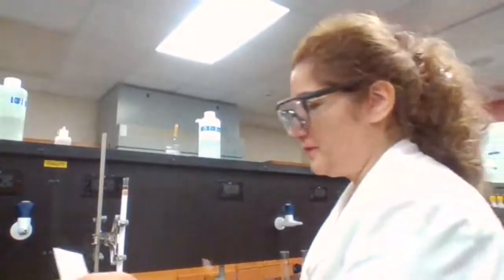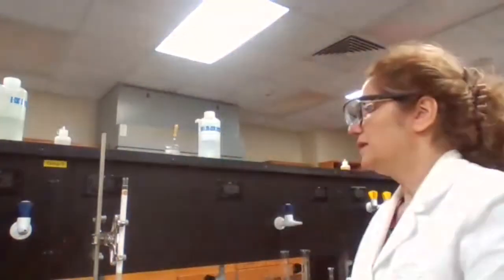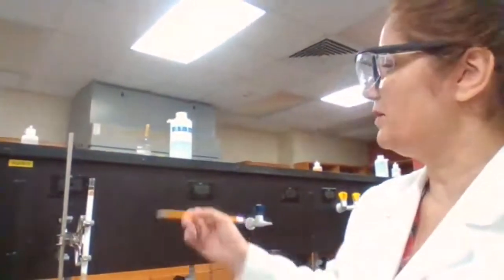So while we are waiting for the UV lamp, I can probably ask you to tell me what is my next step for the column chromatography. We're going kind of back and forth, but we are doing two experiments at the same time. I'm trying to use the time wisely and be more efficient.